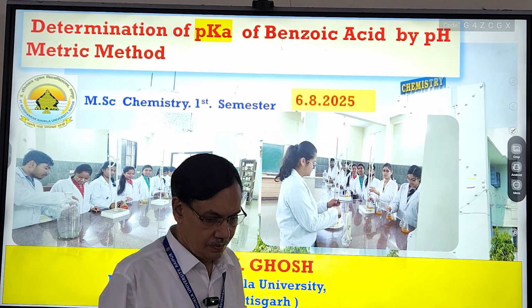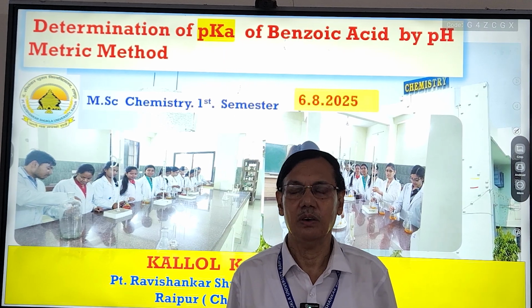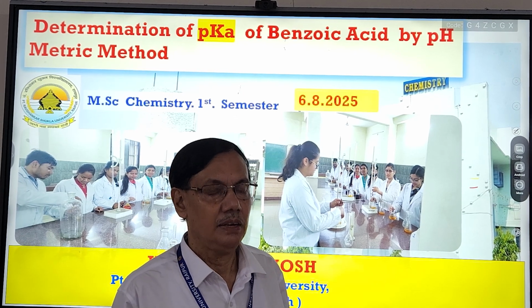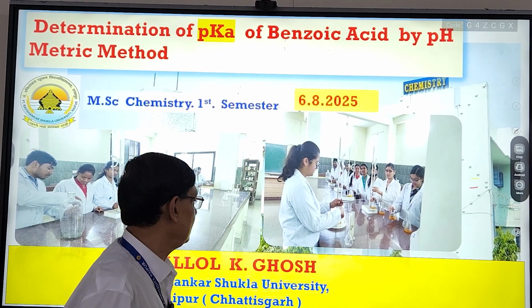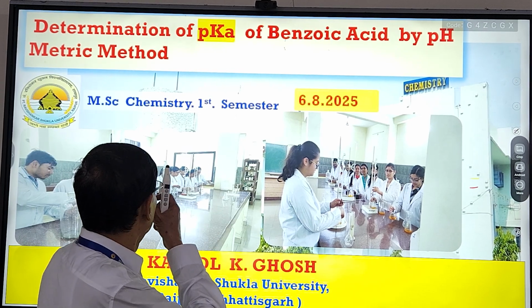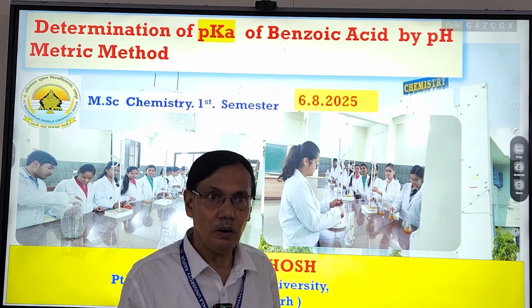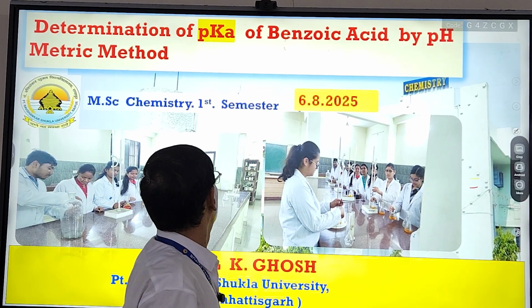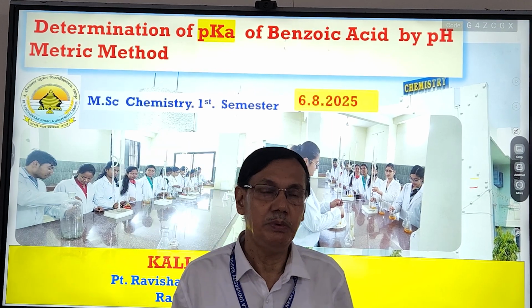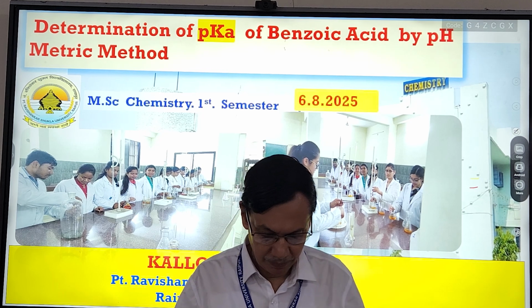Today we will demonstrate one of the most important experiments of physical chemistry M.Sc first semester, that is determination of pKa of benzoic acid by pH metric method at room temperature.